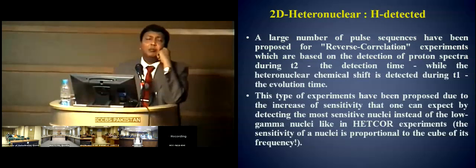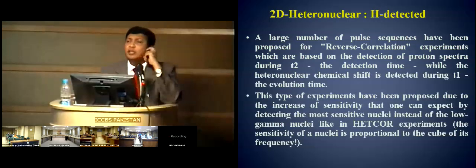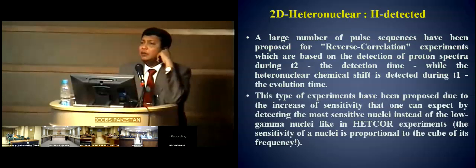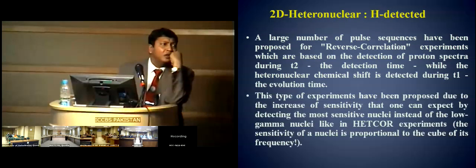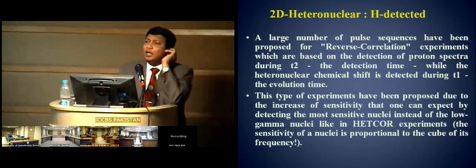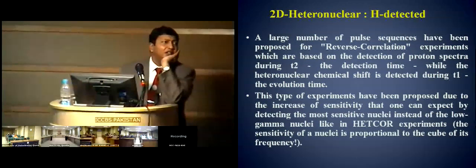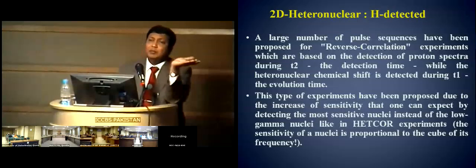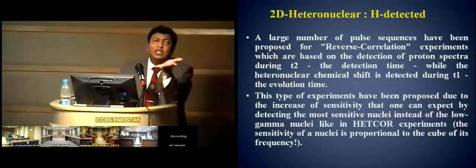Something very interesting appeared when people were doing INEPT, and when they were combining INEPT with APT also. Number one, they learned that the carbon which has no proton would not appear. So it means that carbon is actually labeled by proton. So the information was actually reflecting into carbon, isn't it? No carbon, quaternary carbon primarily means no proton. So when you see the absence of a signal, you say that there is no proton.